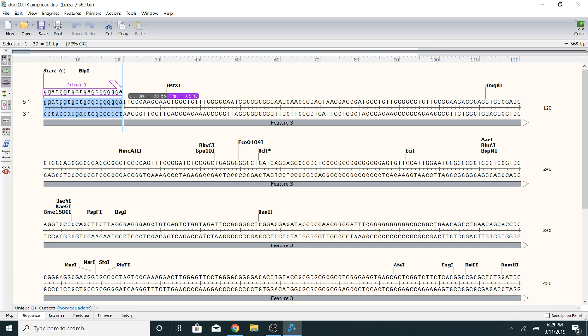Now, they'll also make adjustments for things like the actual sequence. So the number of CG pairings will increase the TM, and your CG percentage, if it gets really high, can throw things off. The pairing between A and T and C and G is a little bit different, because A and T have two hydrogen bonds and C and G have three hydrogen bonds. So theoretically, CG bonds are stronger than AT bonds, and that means it needs more energy, more heat, to separate the primer from the template. So that means you need a higher melting temperature.